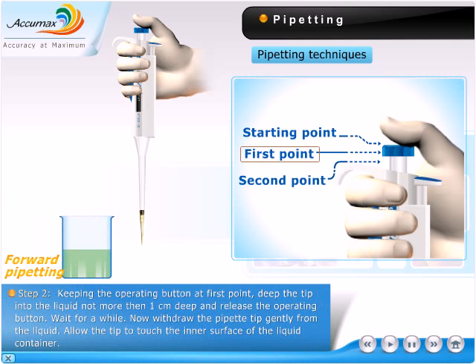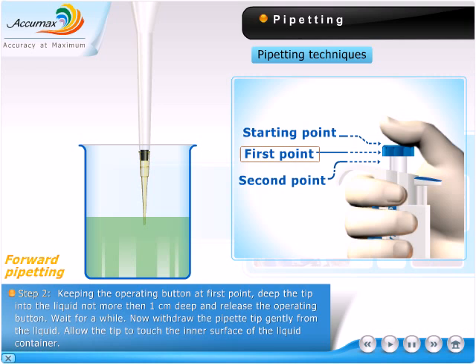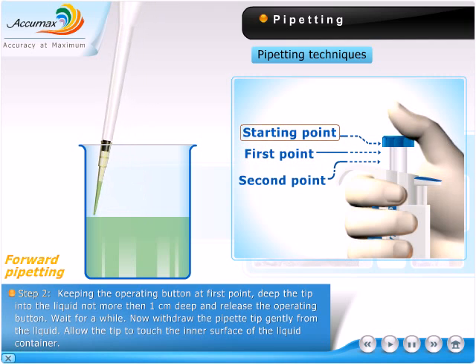Keeping the operating button at the first point, dip the tip into the liquid no more than 1 cm deep and release the operating button. Wait for a while, then draw the pipette tip gently from the liquid.